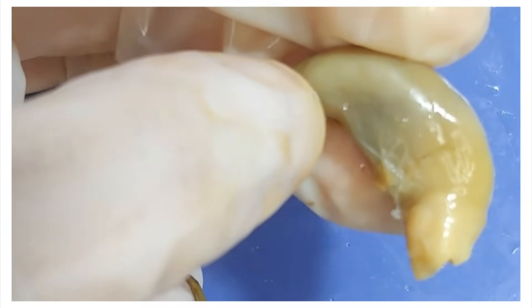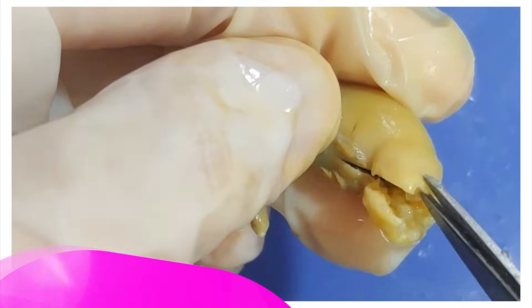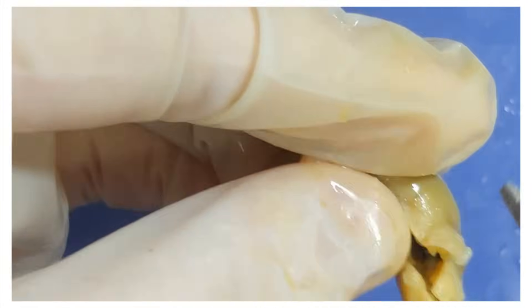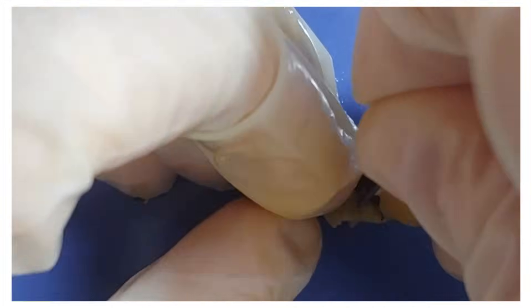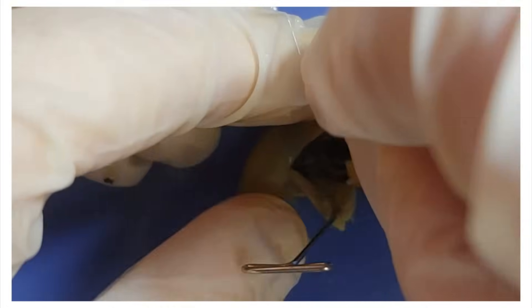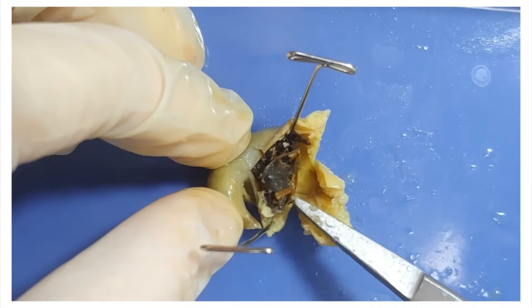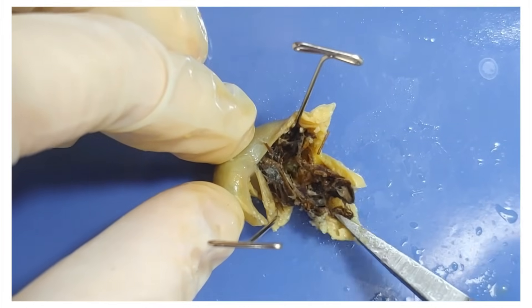Here are some outtakes of me dissecting the stomach, because I was curious what was inside. Oh wow — that's the frog's last meal right there. It kind of looks like pulled pork. There's probably some unlucky bug in there — I hope it was a mosquito.